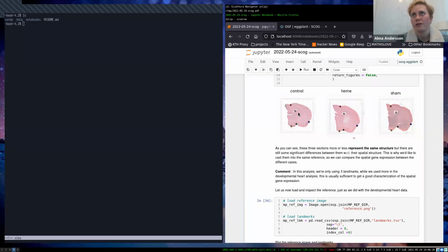Yeah, interesting question, and I've gotten that a couple of other times, and I guess to some extent I'm the wrong person to ask here, because my answer would be if they seem to have a fairly similar structure, that is something that again makes sense to compare structure-wise. Yeah, that would be a good analysis to conduct. But otherwise, just as it's useless to compare lungs and liver, it would be useless to compare two different species if there's no similarity or no common ground where they should be compared. So it's totally dependent on the tissue and the biology there. And yeah, my skills aren't super good in the biology part.